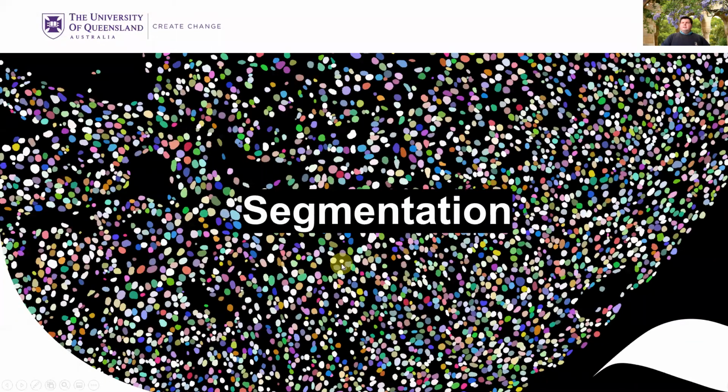Now, the next step that you can use in your analysis pipeline is segmentation. Segmentation can be done using thresholding or analyzing particles or manually drawing and creating selections. If you have lots of data sets or you have complicated data sets, you can use some existing plugins that have been published to segment your data quite nicely.